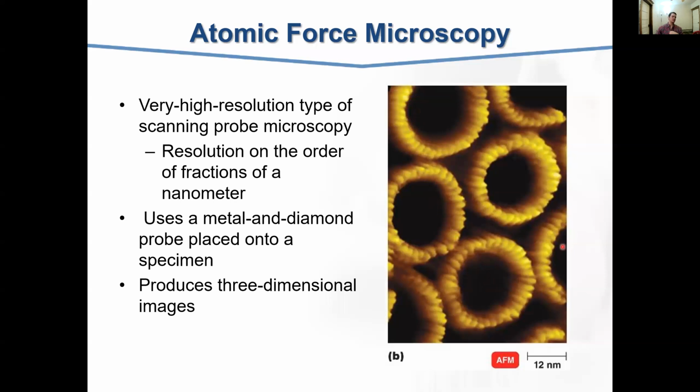This is the protein that takes hold in the human plasma membranes, and it plays a role in the formation of gas gangrene. Don't look for pictures of that. It really looks disgusting. People form these gassy bubbles essentially, and their blood turns poisonous, and it's not great. But the take-home message here is that atomic force microscopy produces insane resolution.